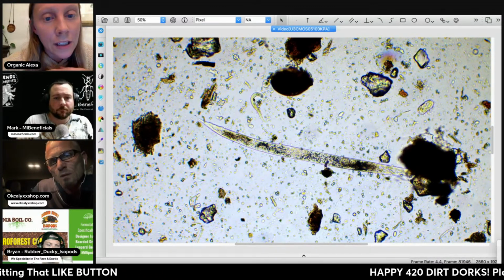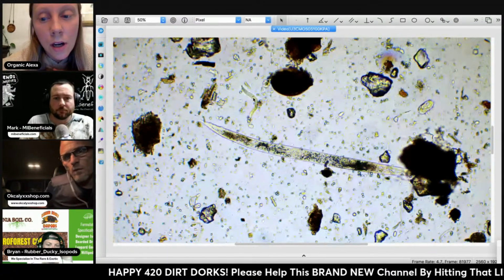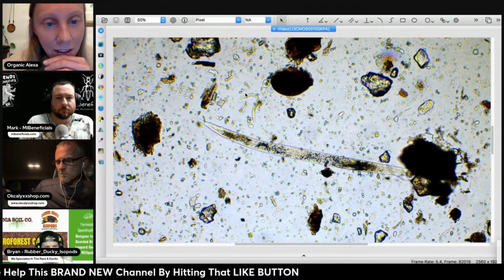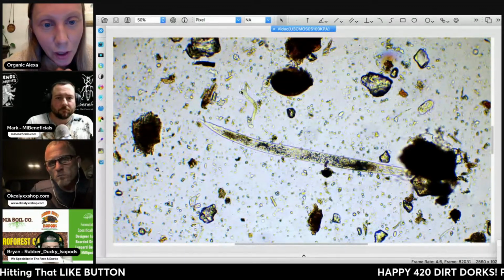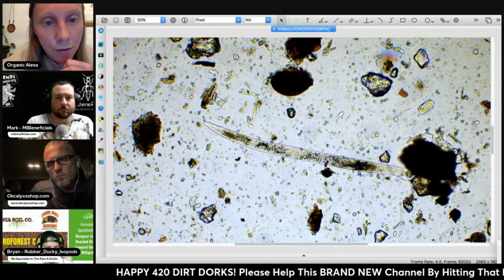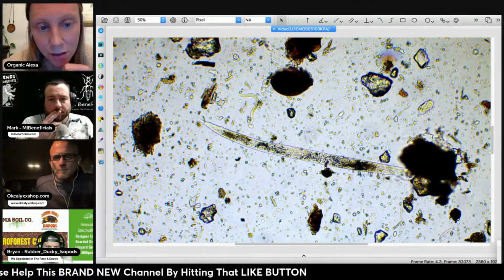There's some that feed on algae and organic matter. There's some that eat other nematodes. So yeah, there's a lot of different types of nematodes, and if you can get them to stand still for long enough, you can tell what their primary food resource is, or what type they are, by looking at their mouthpiece. So the ones that I'm seeing here are primarily bacteria feeders.